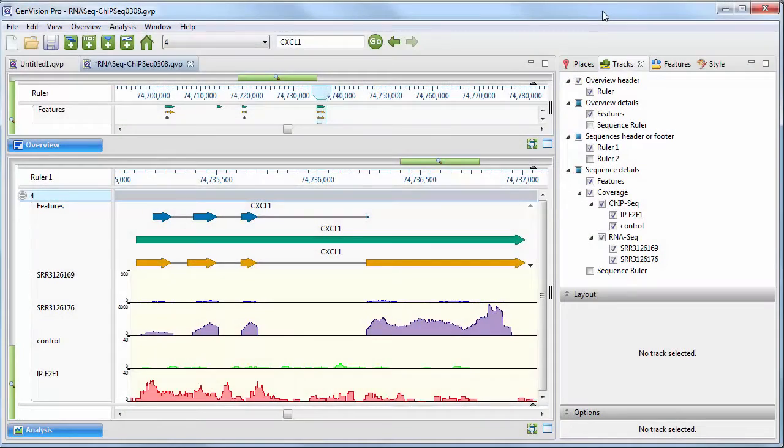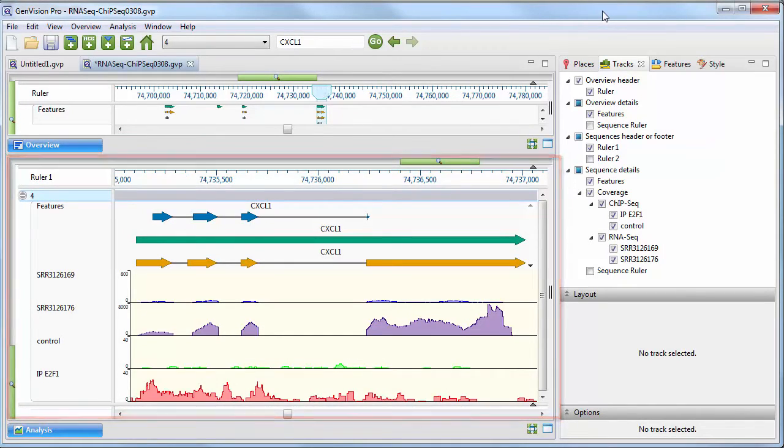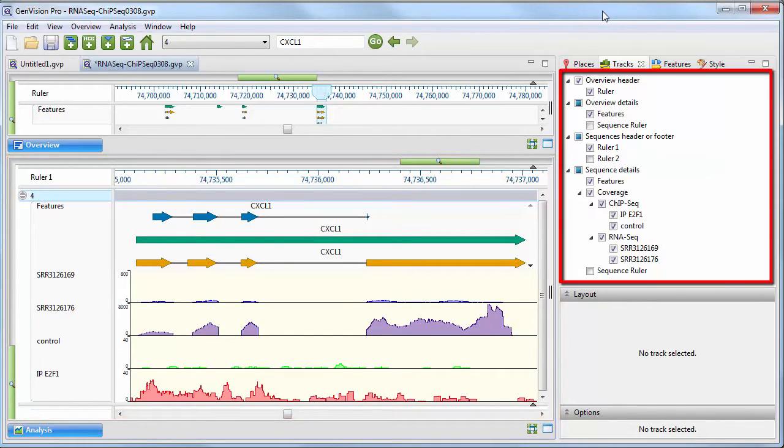As you navigate through the genome, the analysis view will display the sequence details, including all of the selected data tracks.